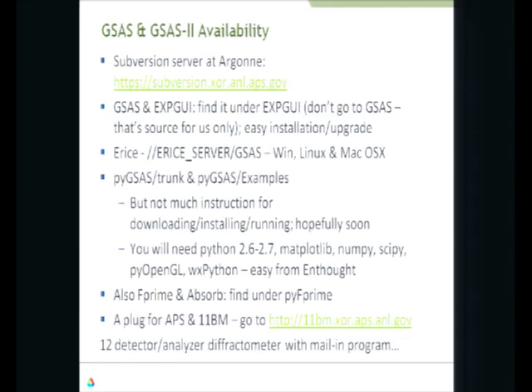And Absorb is useful because it allows you to check to make sure your sample size isn't too big for the absorption problem that you have. So I remember this morning there were people talking about, well, what do I do if I have a highly absorbing sample in a capillary? Well, use the Absorb program. It will tell you how big that capillary has to be, or how small it has to be, in order to get the X-rays through your sample. Very useful little tool.